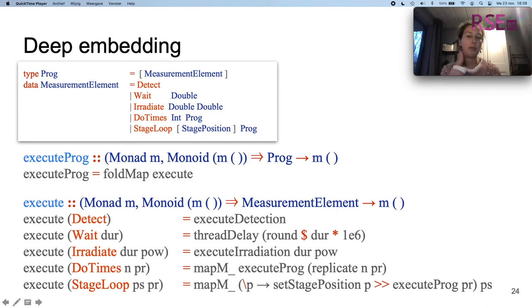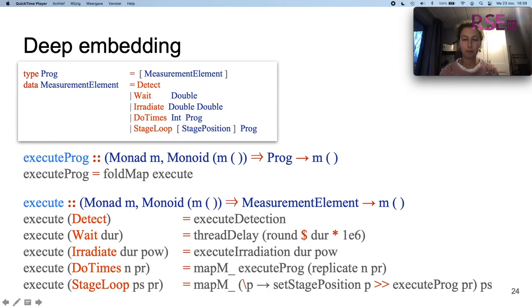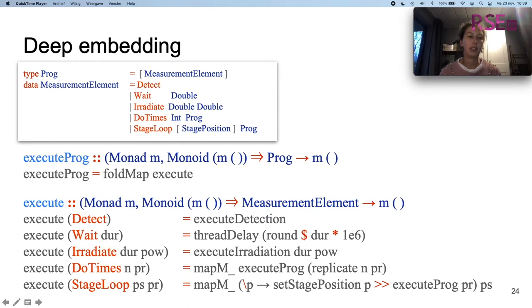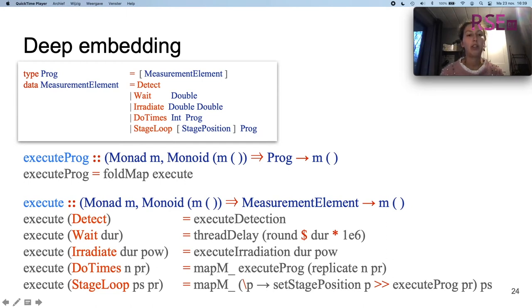In the deep embedding, we pattern match on the constructors to define the semantics in the execute function — this is actually the traversal of the abstract syntax tree. For example, if we execute wait for a certain duration, we actually call the function thread-delay, which is a function of our host language Haskell, so we can make use of it. As we are working in a Monad M, we also have control over the side effects happening in the program.